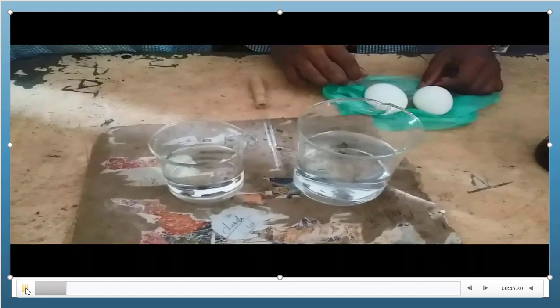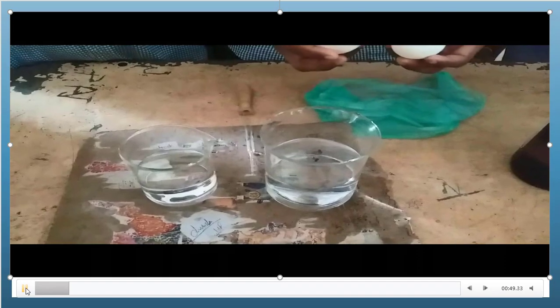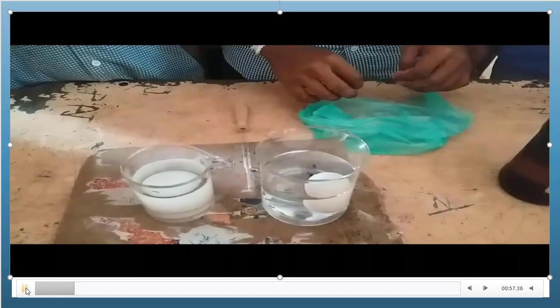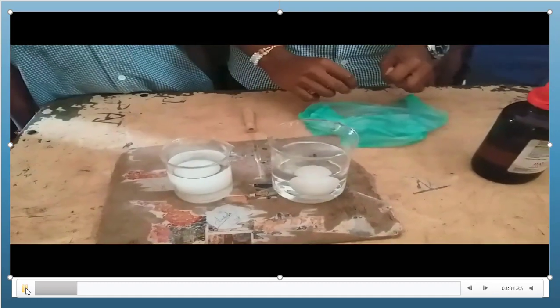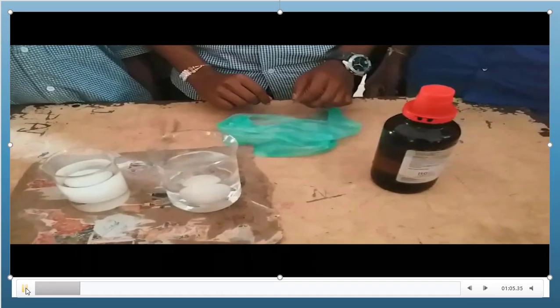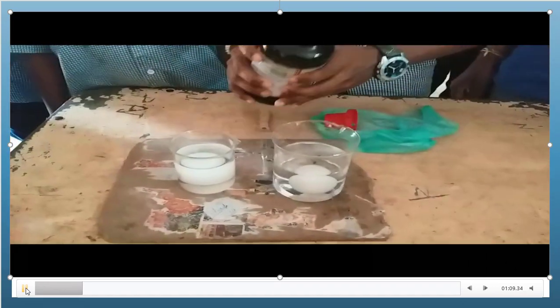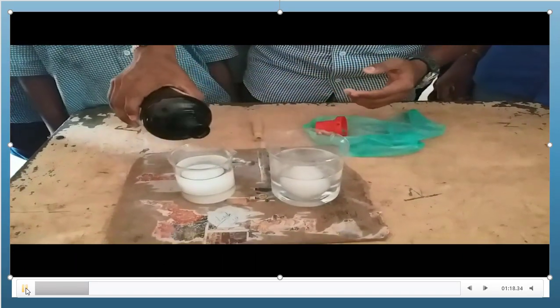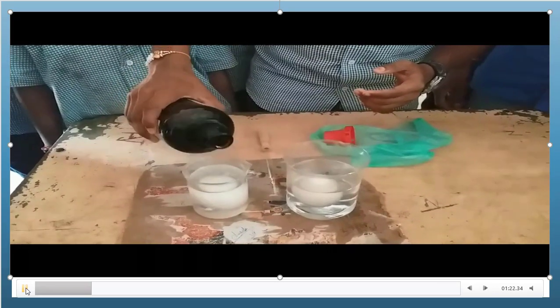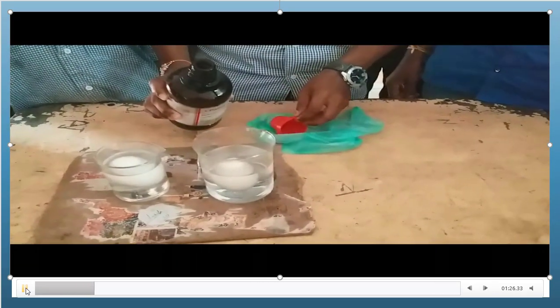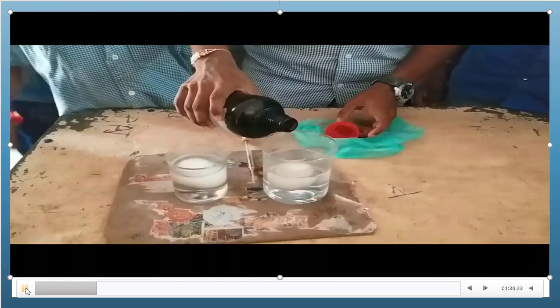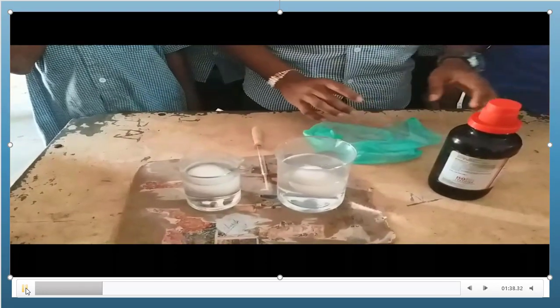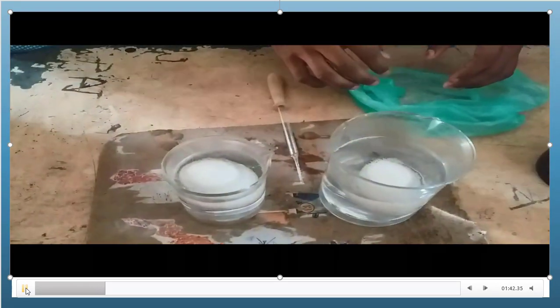We also need a dropper. To remove eggshells, we have to keep the eggs in water. Do not directly take concentrated hydrochloric acid in the beakers — that acid may harm your fingers. So first keep the water in the beaker, add the egg to it, and later add the concentrated hydrochloric acid to the water. If you don't have hydrochloric acid, you can use bathroom cleaning acid, which also removes the eggshell.